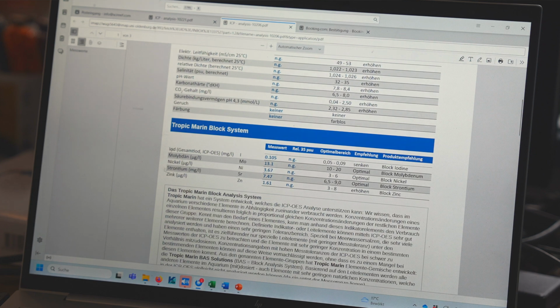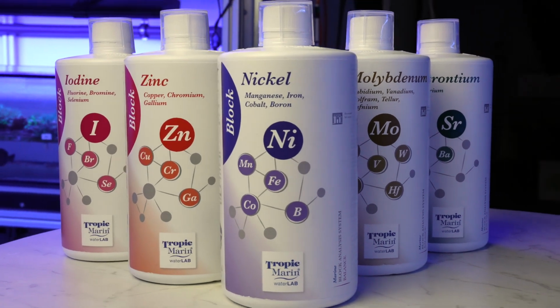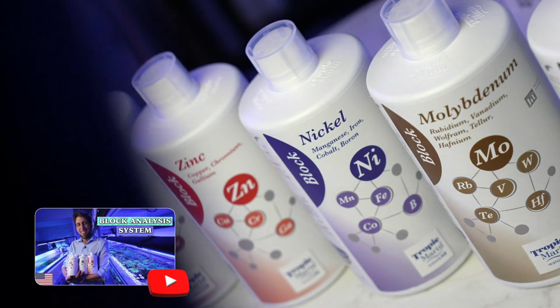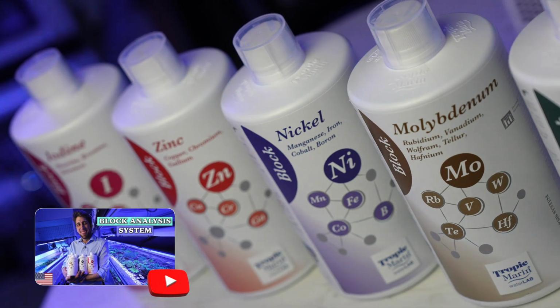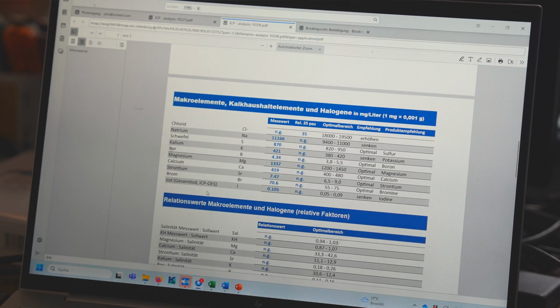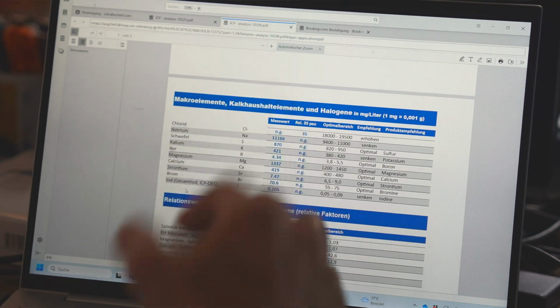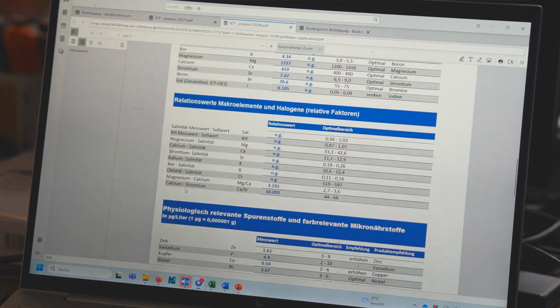And then we come to the Tropic Marin block system, so the new system that allows you to dose certain element groups specifically. There's another video about that, and there's more coming, so I'm not going to go into detail with that one here. The next category is the macro elements that are used for calcification, and also halogens that are important for the health of the organism, so it gives you all the concentrations. Again, there's one missing that cannot be measured in the ICP, that's chlorine. We got the relations, because the relation of certain elements to salinity is also really important.